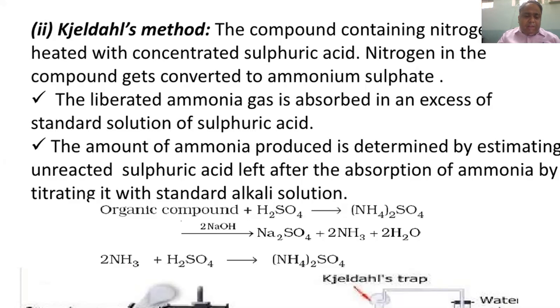This ammonia gas is now used for neutralizing H2SO4 solution of known volume and concentration. Then how much H2SO4 is consumed? From there we come to know how much ammonia was produced, and the proportionate quantity of nitrogen.